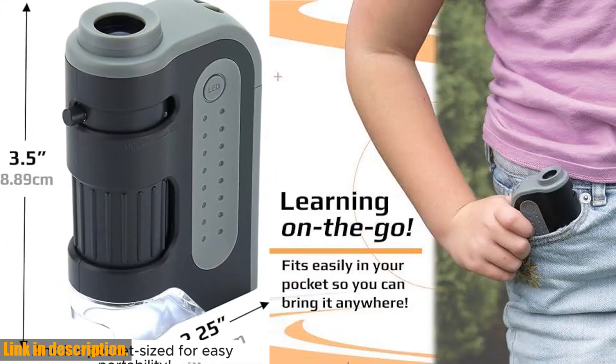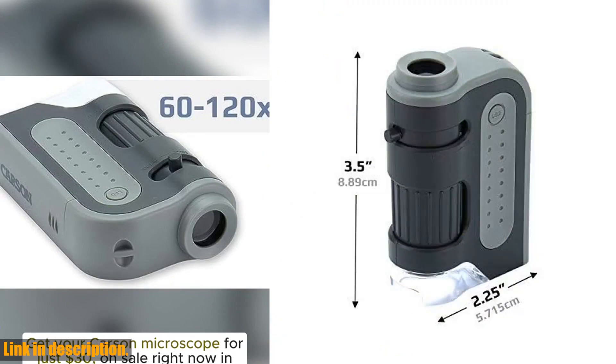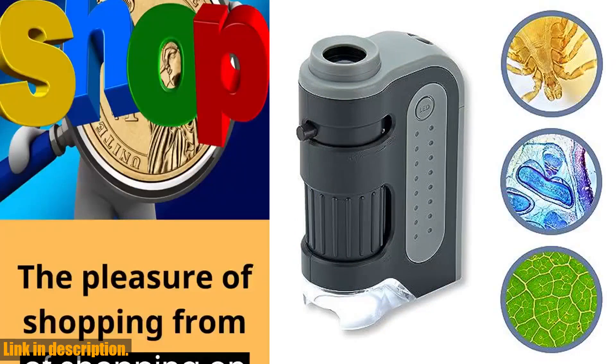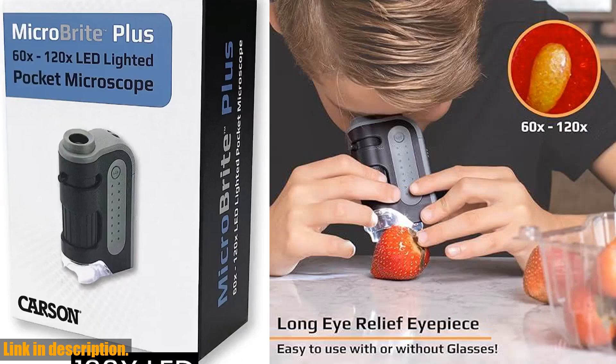The MicroBright Plus is compact and lightweight, making it ideal for portable use in the field or in the lab. Its bright LED illumination system ensures clear vision and accurate observations, while the versatile magnification range of 60X to 120X allows for stunning accuracy and precision when viewing prepared microscope slides or everyday objects.